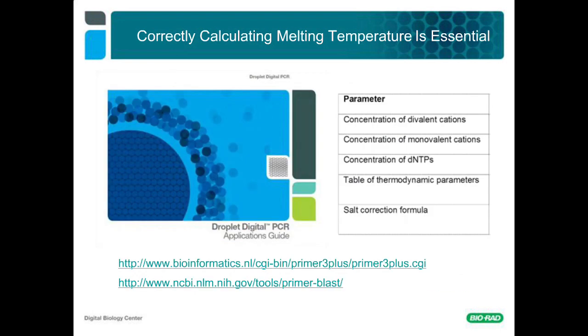Here are two URLs listed for two free sites that you can use for assay designs, Primer3Plus and NCBI Primer-BLAST. Note that the nomenclature shown here is based on Primer3Plus.